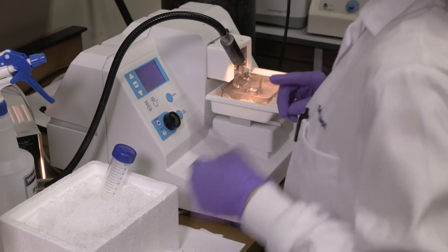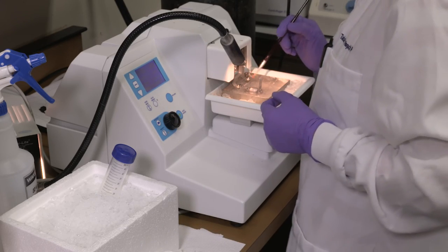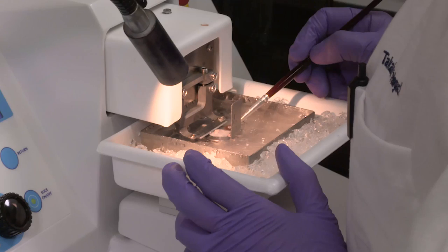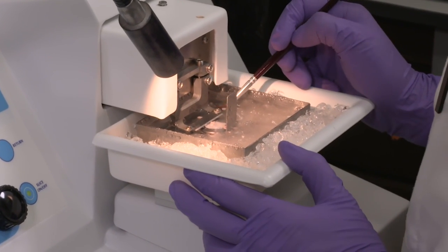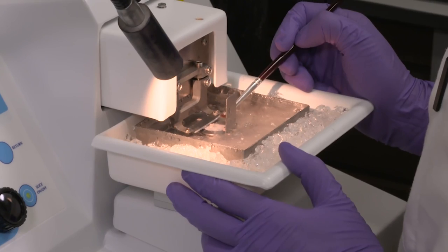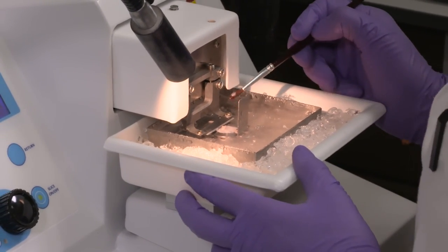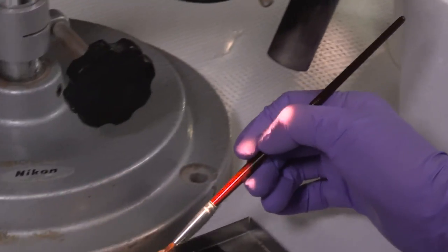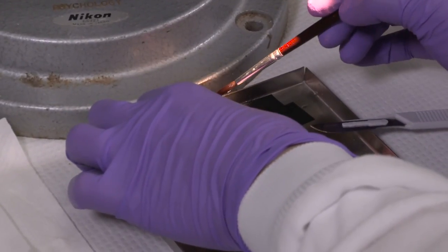The vibratome water bath is filled with ice cold saline and the brain slices are cut slowly with the vibrating blade to minimize the damage to neurons. For imaging purposes, we will slice into 200 micrometer thickness.